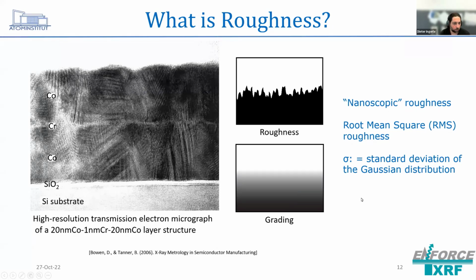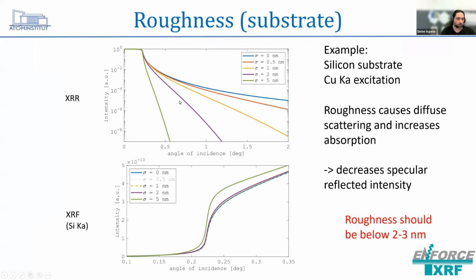as we see here. First, the substrate is relatively clear, so that's why we suggest for TXRF that the quartz reflectors should be smooth and polished, because as soon as we are hitting some roughness, already at 1 nanometer it starts dropping here.